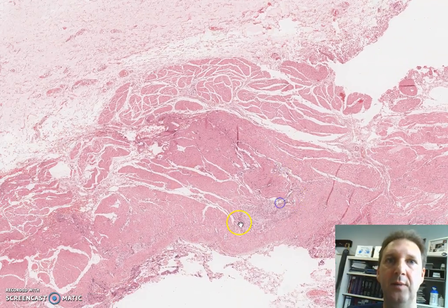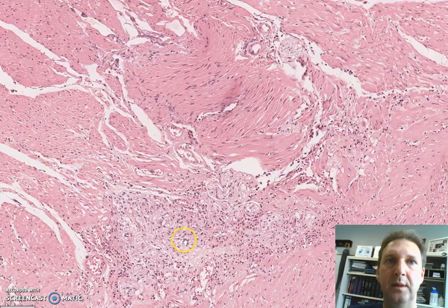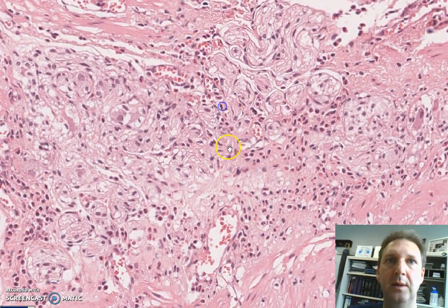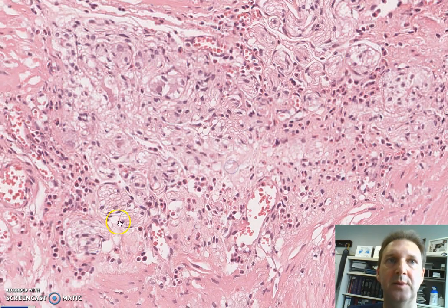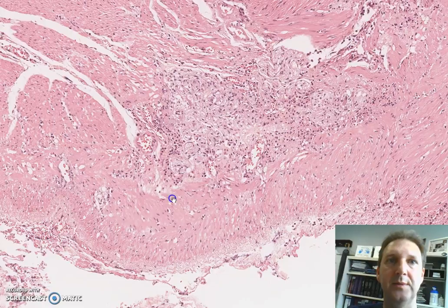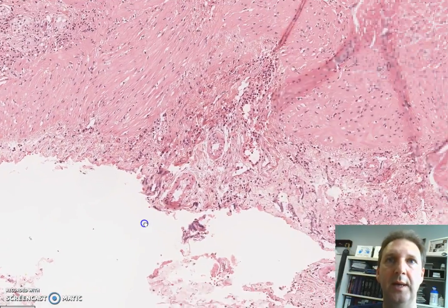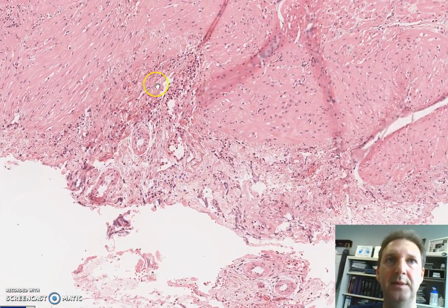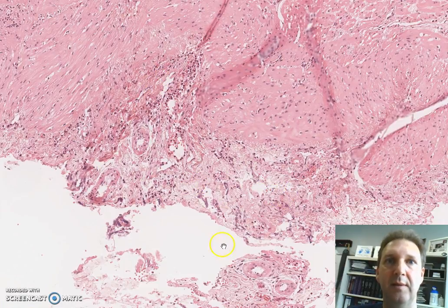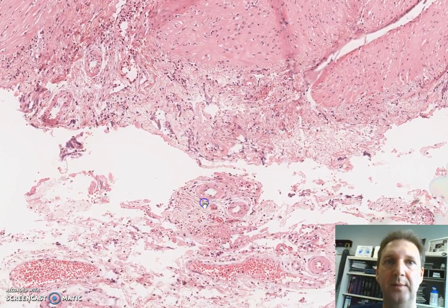Occasionally we can see some nerves right here — some nerve structures for the innervation of this smooth muscle. Finally, we can see a distinct serosa with some fat cells and blood vessels.